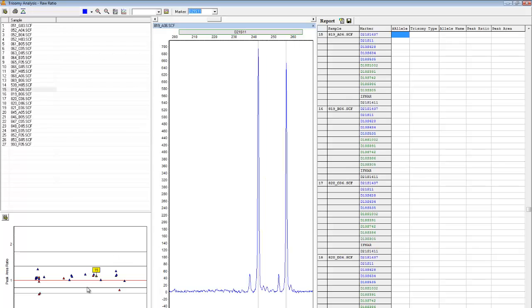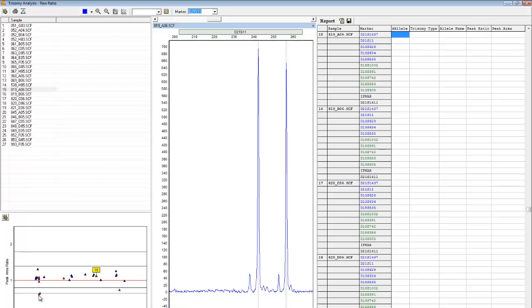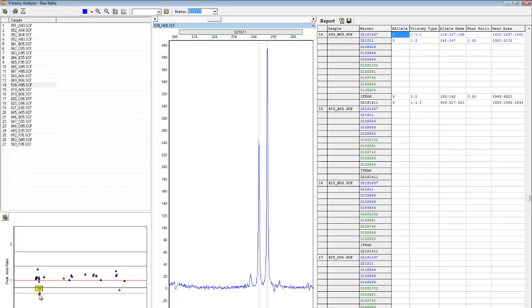Furthermore, points between these two black parallel lines are in the normal range. Points outside of the black parallel lines but within the gray parallel lines are in the inconclusive range, and points outside of the gray parallel lines are in the trisomic range. Simply click on a point to be taken to its location in the report table and its electropherogram.